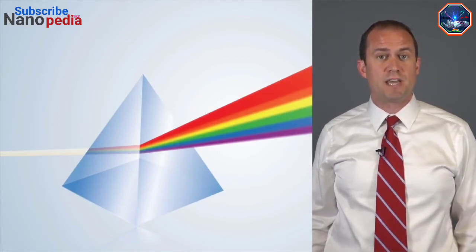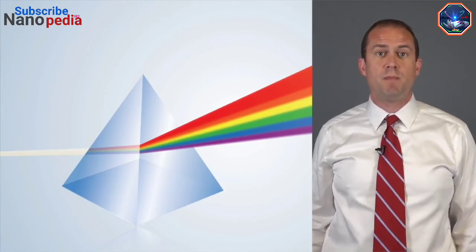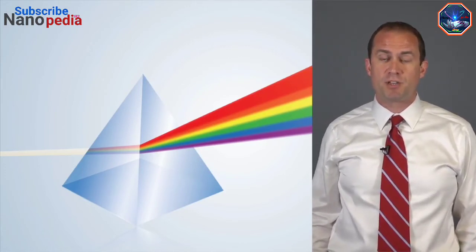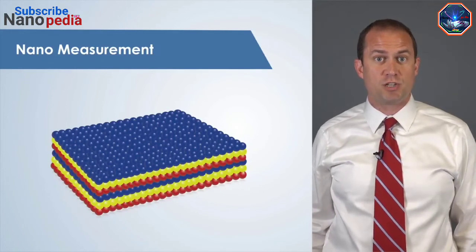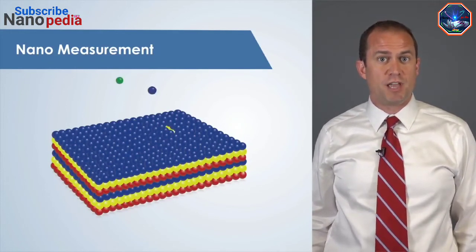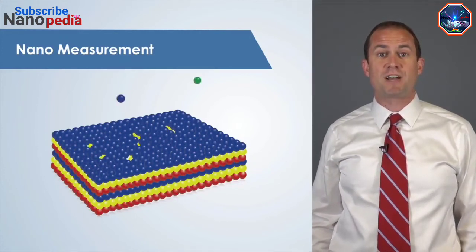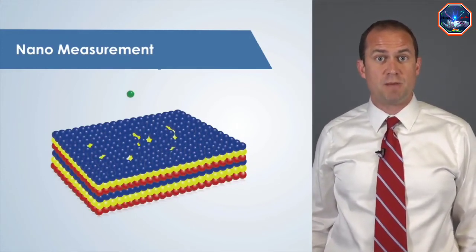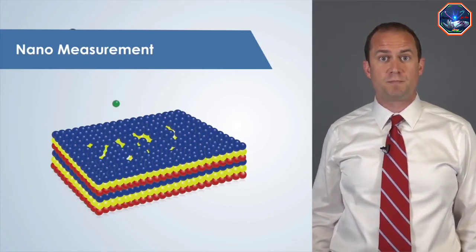The way the incident light particles change direction after hitting the material can be measured and can reveal information about the material. Or the particle can cause changes in the material itself, like structural changes or absorbing energy and vibrating bonds within the structure. Forcing these interactions to occur and measuring them helps us define and discover properties at the nanoscale.